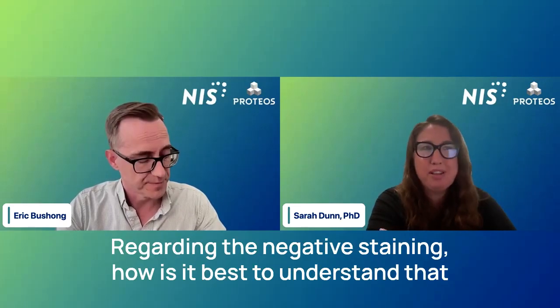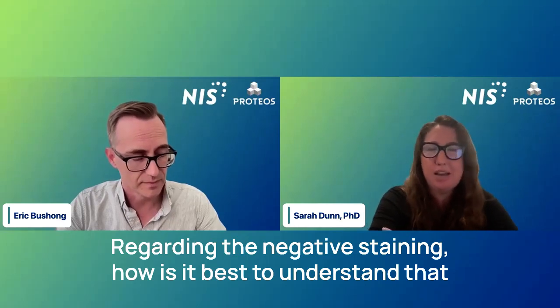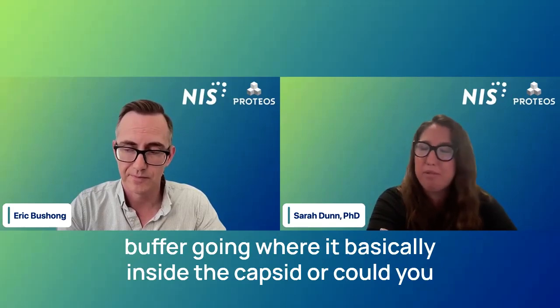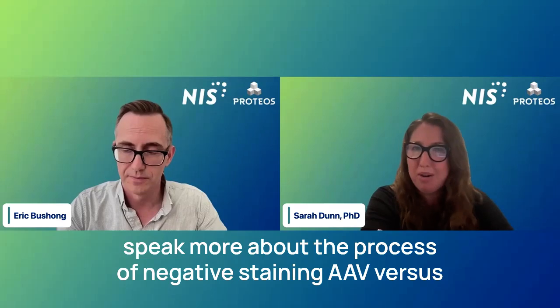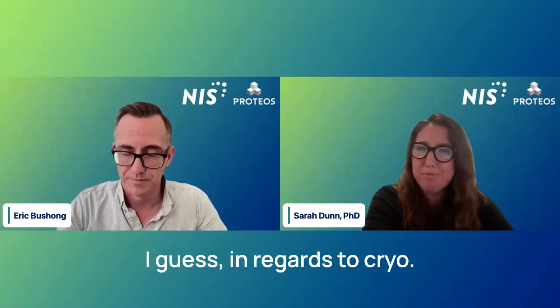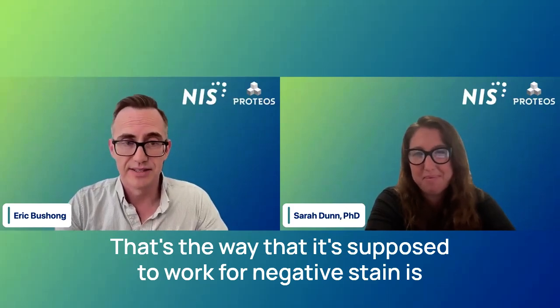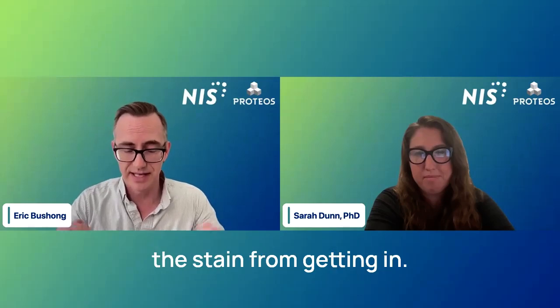Regarding negative staining, how is it best to understand that regarding the DNA that's inside? Could this prevent the staining buffer from going inside the capsid? Or could you speak more about the process of negative staining AAV versus cryo? Well, that's the way it's supposed to work for negative stain: the DNA inside the capsid prevents the stain from getting in.